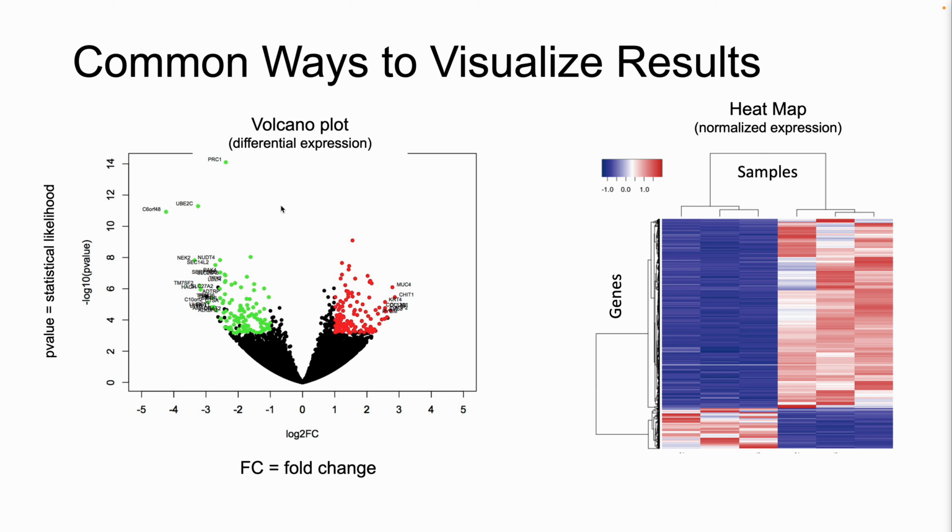If you have really good sampling and there's not very much noise in the gene expression, you can have things that are statistically significant but have very low fold change. And so you also have the question there about, is that biologically relevant? My fold change is 1.2, so they're barely any different, but my stats are so good, I've got a big enough sample that it's still statistically significant. I don't know if I want to interpret that biologically. And so volcano plots are meant to show both of those things at the same time.